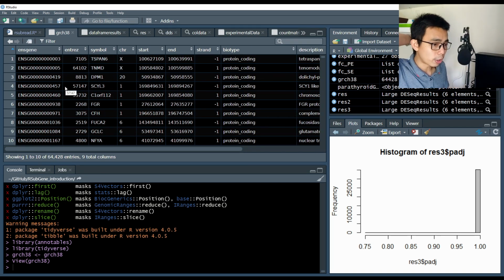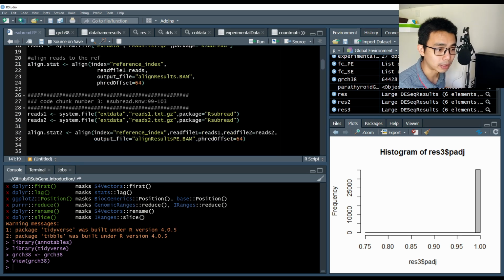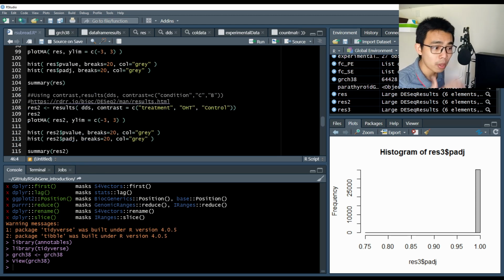So when you're doing your mapping, you could actually just use this as part of your index, just now. Where is it? Yeah, the annotation table just now. So when you map it, you should be able to get your annotation result directly if you need to.